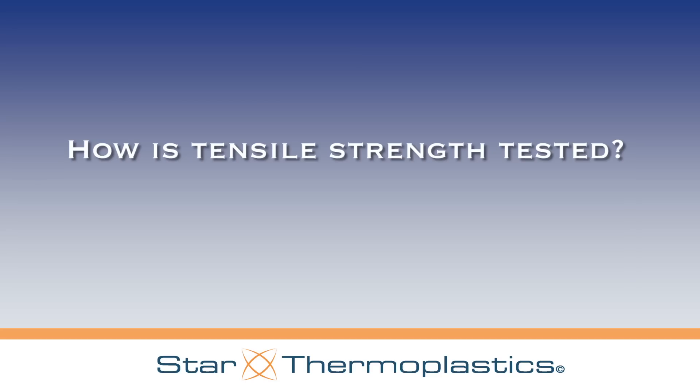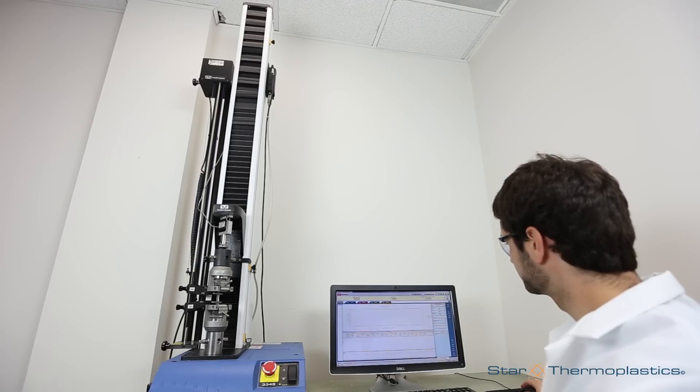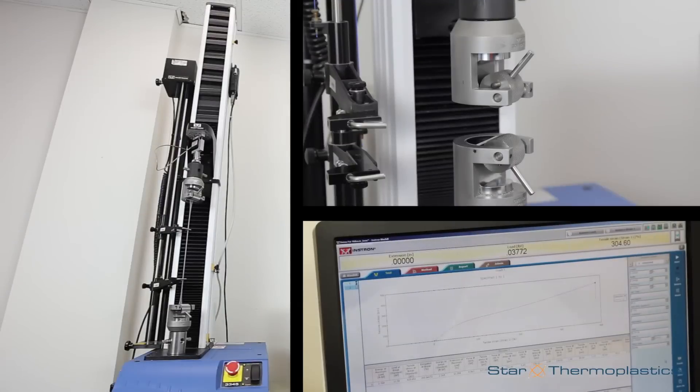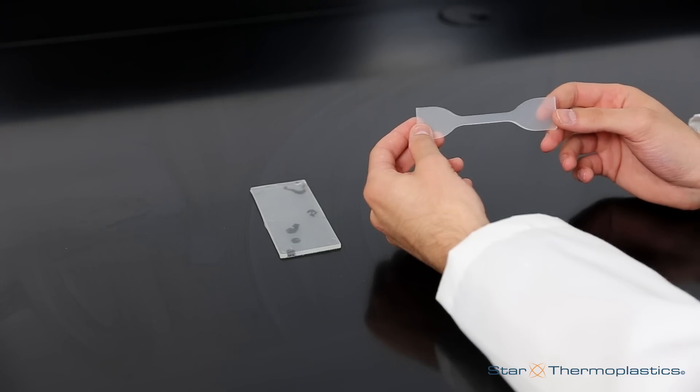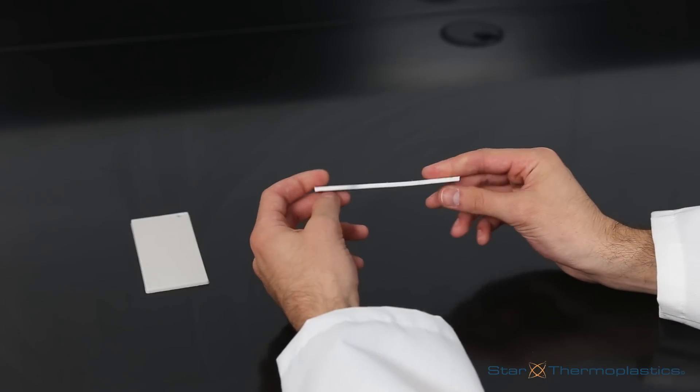Let's take a look at how tensile strength is tested. Here's a tensile testing machine from one of our five laboratories. In order to perform the test, you will first need the proper machine. You will also need a test strip that has been cut into the test shape. For our purpose, we cut them into a dumbbell shape.